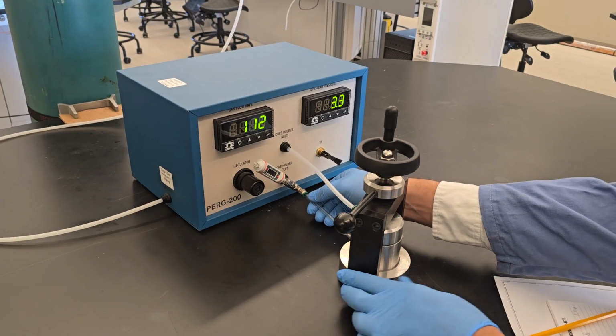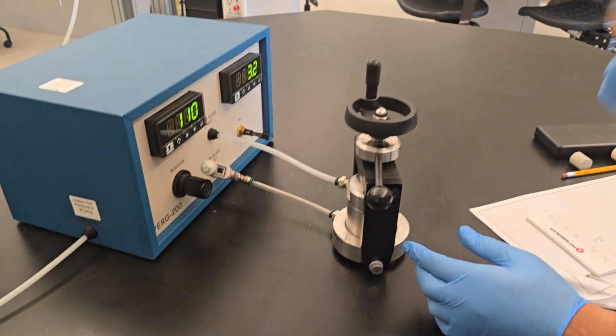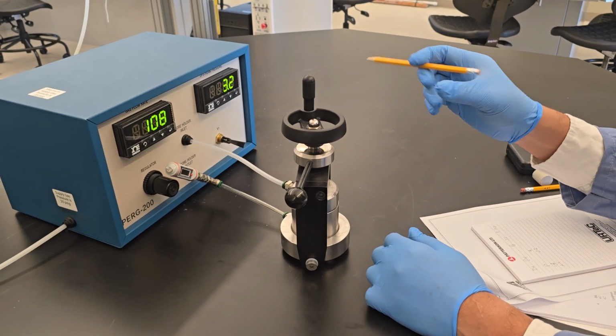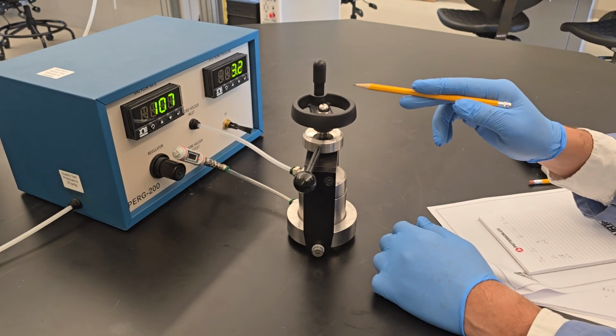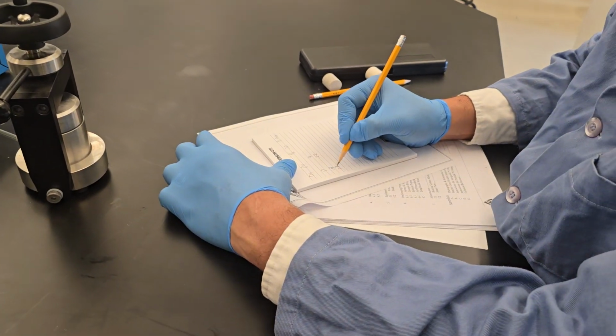All right, make sure all the connections are tight, no leaks. All right, so I got 3.2, flow rate's fluctuating, 3.2, 108, 107. Okay, so 3.2, 106.